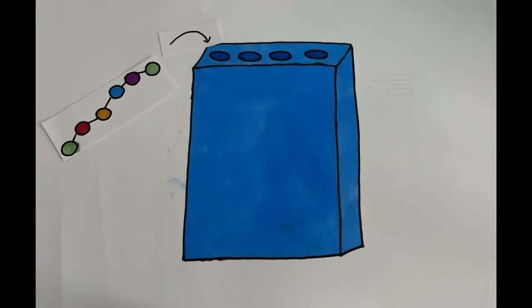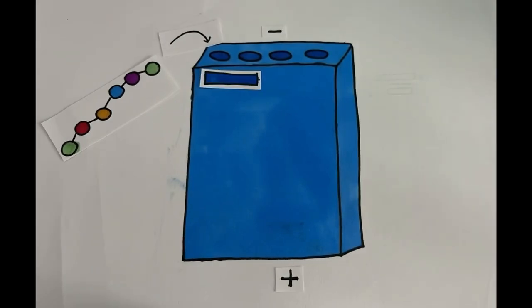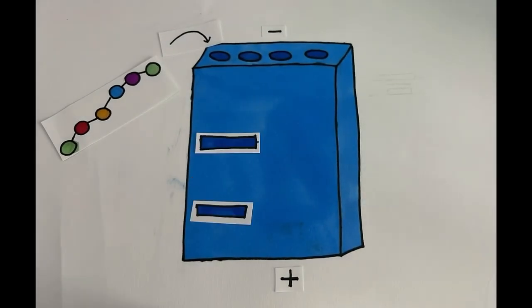Then, the proteins are put into the gel case. The bottom of the gel case is positive and the top is negative. That's why it's important for the protein chain to be negative. Longer chains move slower than smaller chains.